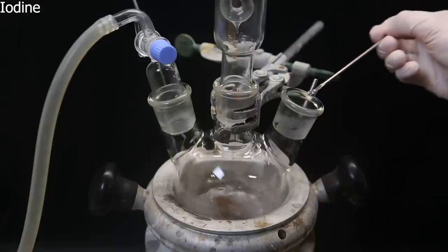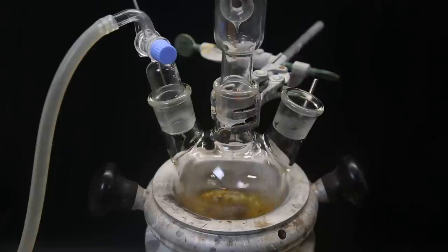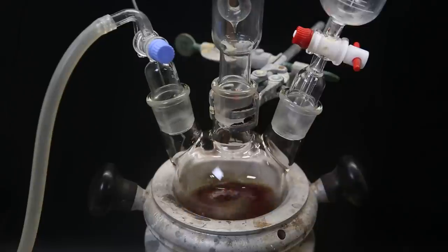Now I add some small pieces of iodine, which will remove the magnesium oxide coating and expose fresh magnesium. The mixture turns a dark orange, and I then attach a dropping funnel.